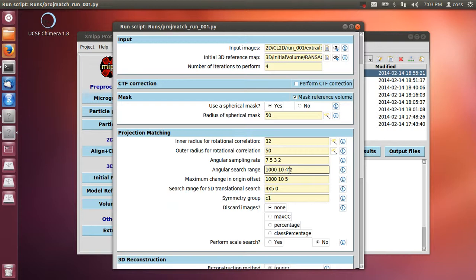And then in the third iteration, they can move only 4 degrees away from the previous one. So these are parameters that force the algorithm to converge. They're not necessary, so many times it converges even if you say 1000, 1000, 1000, 1000. So you leave them all the time to choose freely the position that they like.